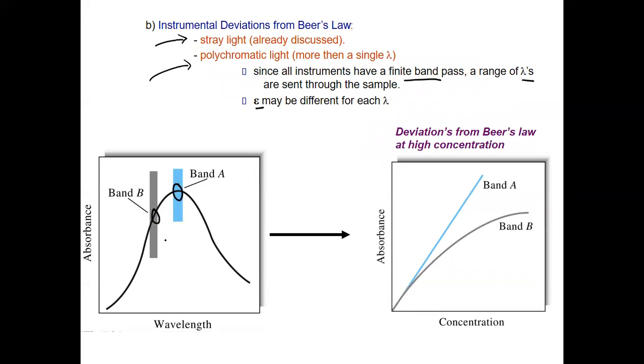Okay, so if that's the case, you could see that there are what we call different wavelengths here. Now if you're going to compare the bandpass that you have there, ideally you want it to be like this, where you have the B and the A. But unfortunately, if you have only the band A, which is this one, or you just look at band B, you might have it like this, because the band B is not usually the lambda max.